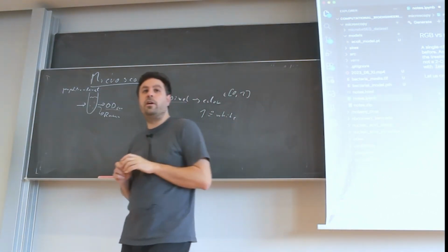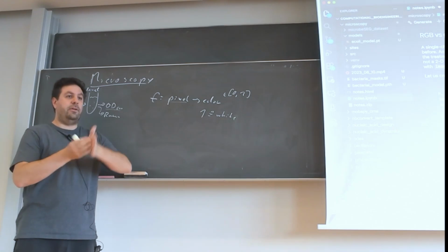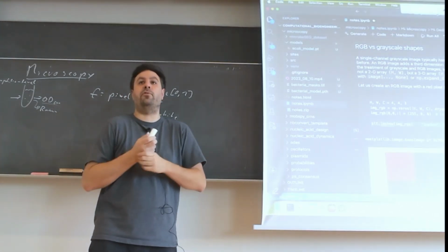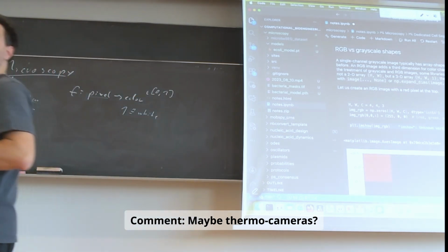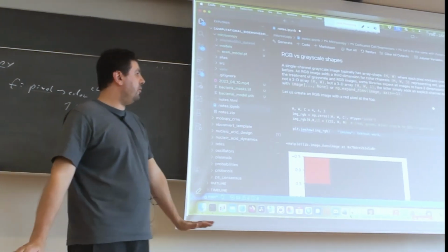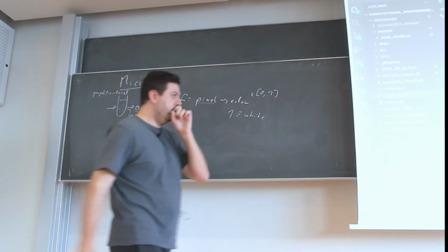In this particular case. But for example, you can think of something like fluorescence. Not a normal camera, but a microscopic camera might give you fluorescence for yellow, fluorescence for red, and so on and so on. You can have an arbitrary number of channels that are not shown in classical images, but in a microscopic image it would make sense. Any kind of spectrum you can think of, you can put there. Very good, yeah. We will not use that in this course. We're using just classical light microscopy here, but you could completely do that here also.